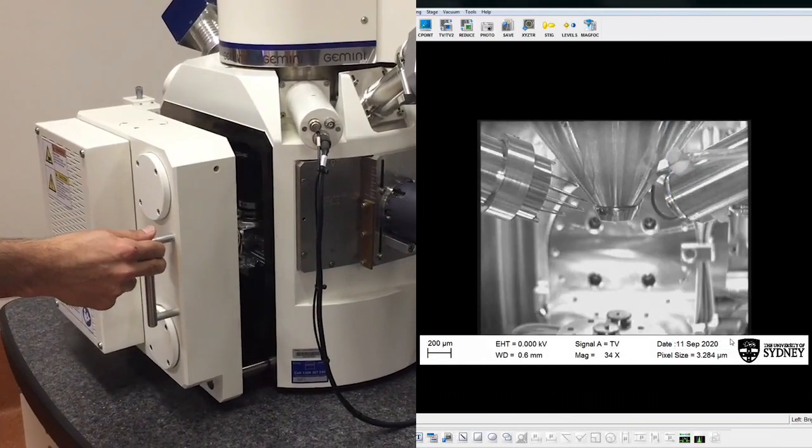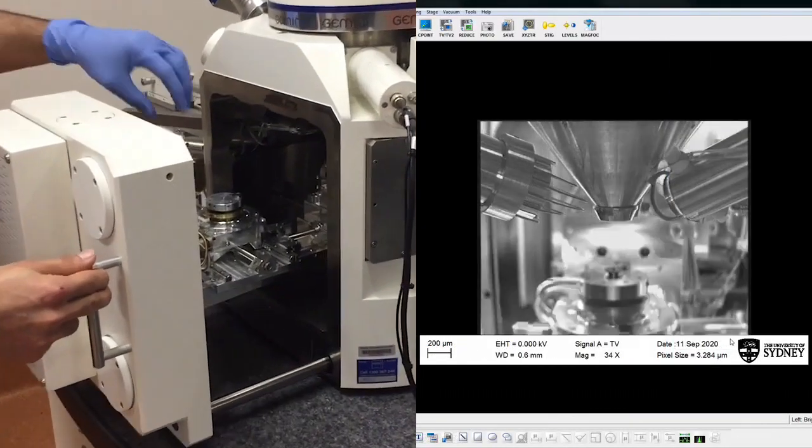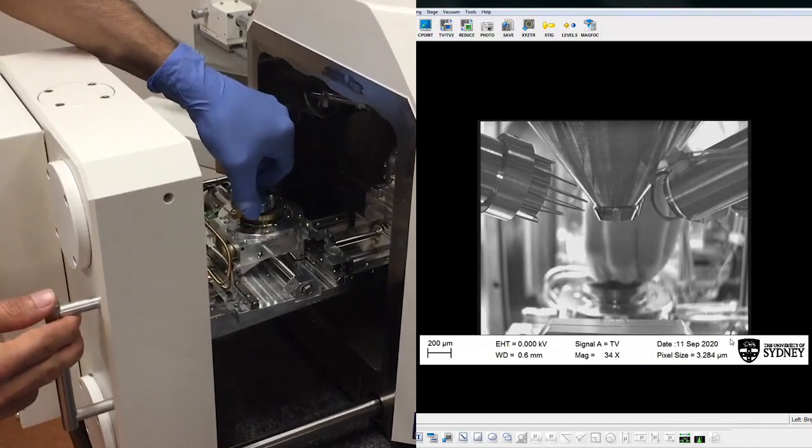With a gloved hand, remove the specimen holder, then close and pump the chamber.